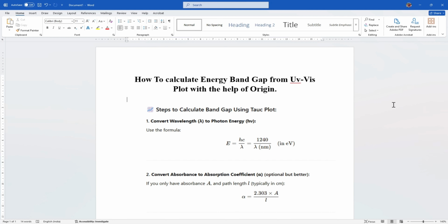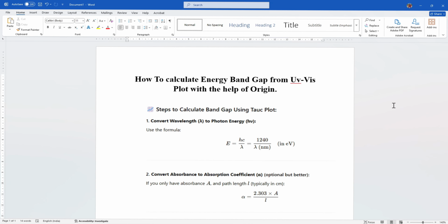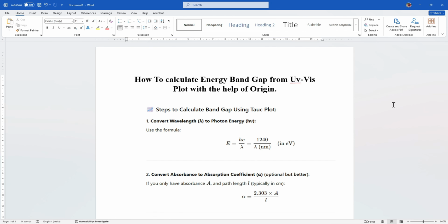Hi guys, welcome to this video, and today we are going to learn how to calculate band gap energy from UV visible absorption spectrum with the help of Origin.